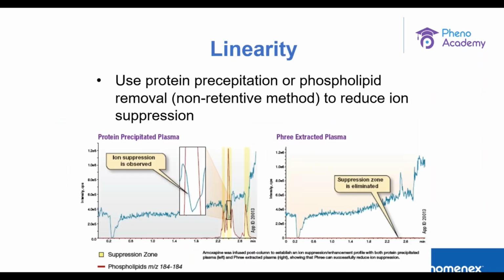Ion suppression will be another major linearity issue when we're using a mass spec detector. So again, if we are facing some ion suppression, solid phase cleanup, SPE, is really helpful.